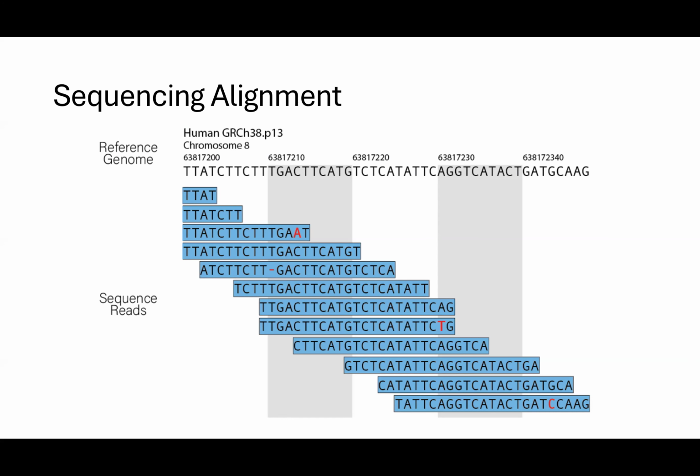So we're basically going to assume that mutations we see are sequencing errors and not genuine mutations in the DNA sequence. That lines up with what we see here. We have several reads with this C, and we have one that says it's an A. In this case, it says the human sample, so probably these cells didn't have an actual mutation there. This is just an error in the sequencing.